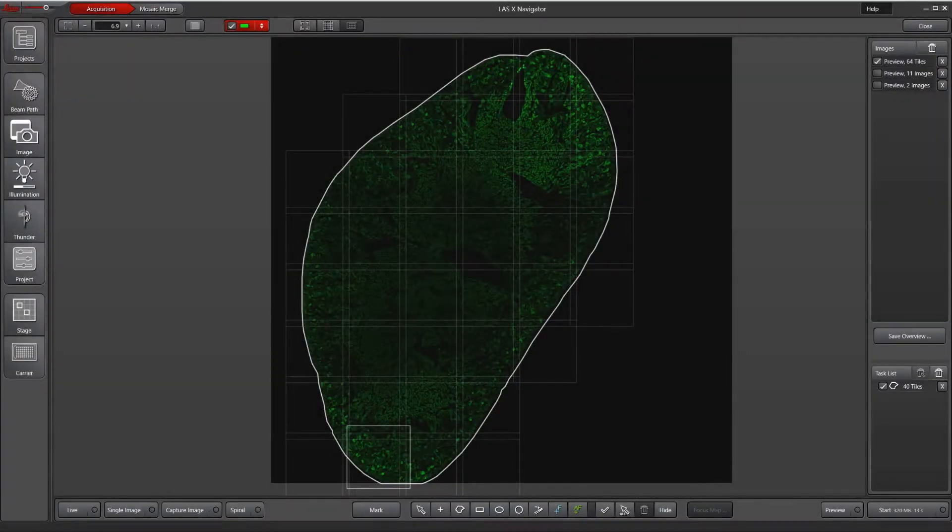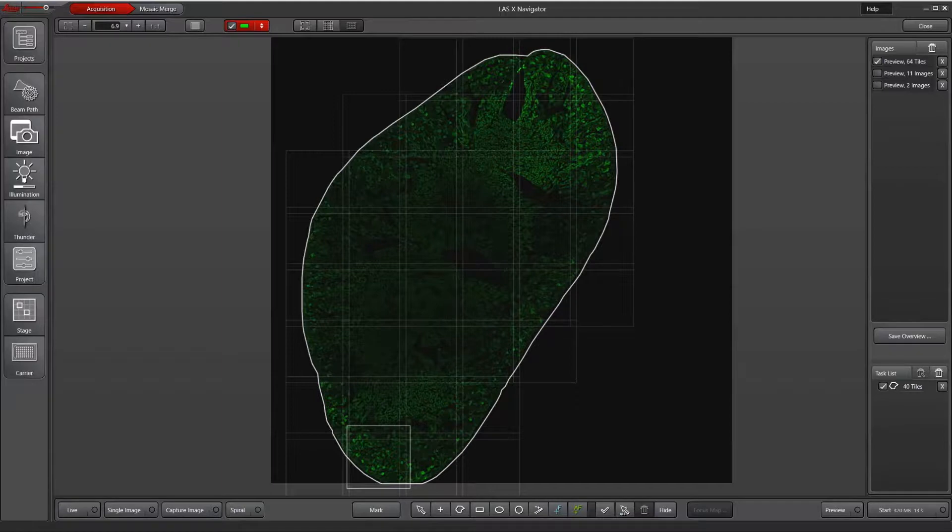In this video, I will show you how to set up a focus map in LASX Navigator. When you have a section of tissue like this kidney and you're doing a tile scan, one of the easier ways to get good focus is to do a focus map.